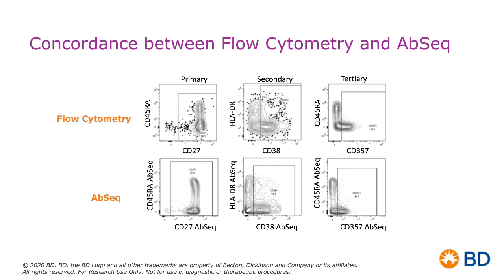When I take a look at data and when I like to compare data, the first thing I ask is, am I able to resolve my populations? Basically a percentage check. Am I getting the same percentage of cells? And of course, I could go through and say, yes, they look pretty equivalent. Although the more important thing, the second thing I like to ask is, how good am I resolving my population? Just because I can see the population doesn't mean I can easily resolve it.